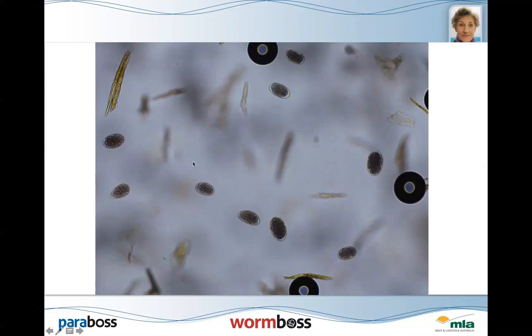So here's some of our worm eggs. They're strongyle eggs. They could be Barber's pole worm, they could be brown stomach worm or black scour worm. The thing is, they all look much the same, and that's why we get a larval culture done as well, because you can't differentiate them mostly under the microscope.